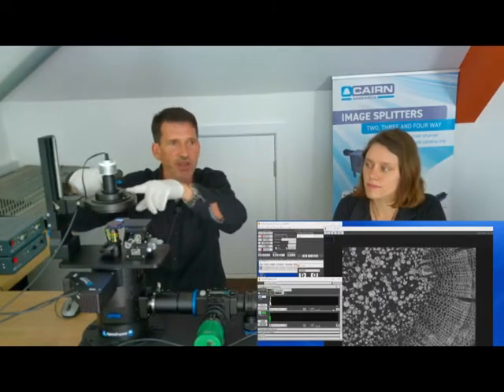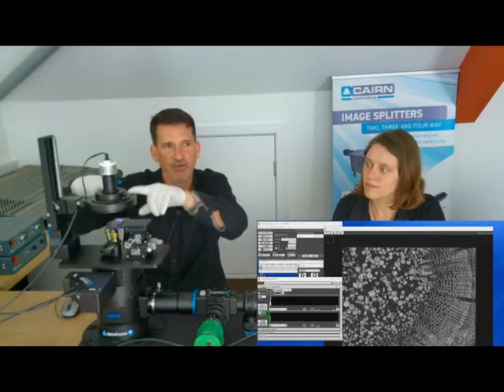The other main thing that we've got on here that we haven't really shown you properly is the Aura phase illuminator. So if I turn off the fluorescence and go to a white lookup table to show things a bit more clearly, and turn up the illumination a little bit, you'll see that this is a ring illuminator, so it has 3 rings, which can be any colour: blue, green, red, infrared, whatever you want.